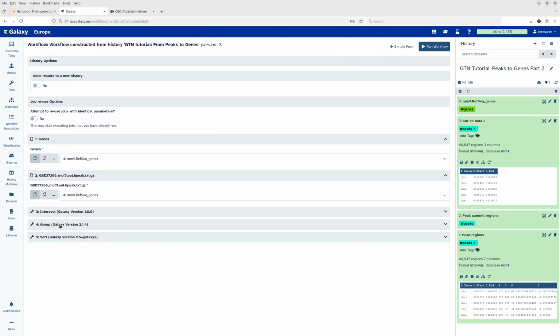And as we know now, for the gene file, we don't want to use the column we used before for the IDs, but now we want to actually use the gene names. We need to adjust this.